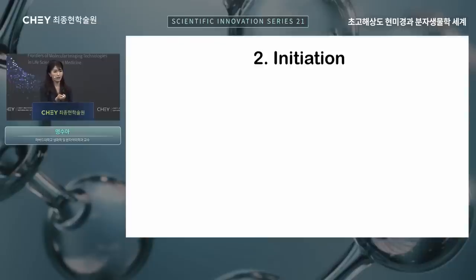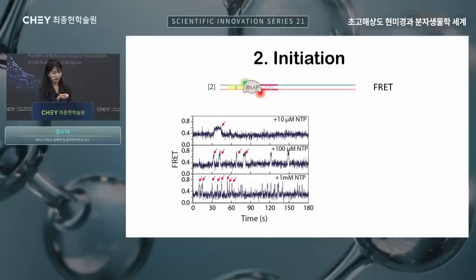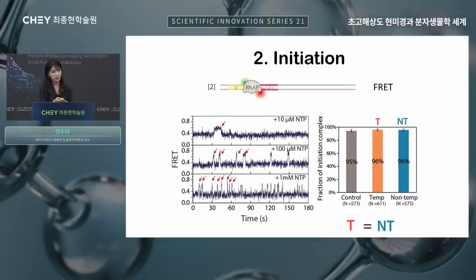Next, we look at initiation of transcription, which is an important controlling step. So this is done by FRET imaging, which TJ already talked about. So there are two dyes, and we measure the distance between the two by looking at the fluorescent signal. So when RNA-P binds and opens a transcription bubble, the dye-to-dye distance is slightly decreased so that the FRET goes up slightly. So that is seen by individual FRET molecules, FRET signal. And as expected, as a function of NTP concentration, you have a higher and higher FRET event that depicts higher rate of initiation. So when we look at that, there's no difference, right? Because it hasn't really gotten to the GQ yet. So it is about the same in all three substrates.